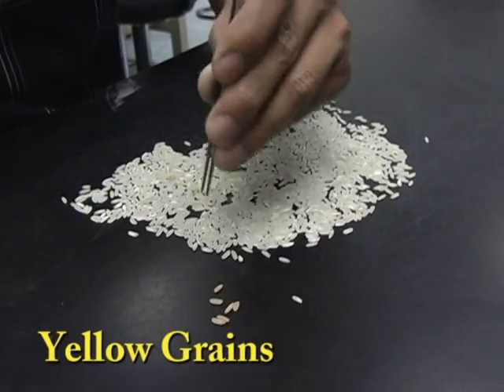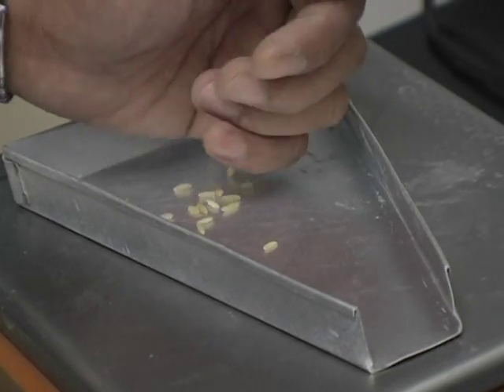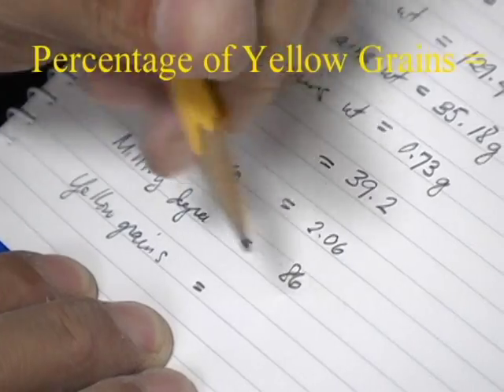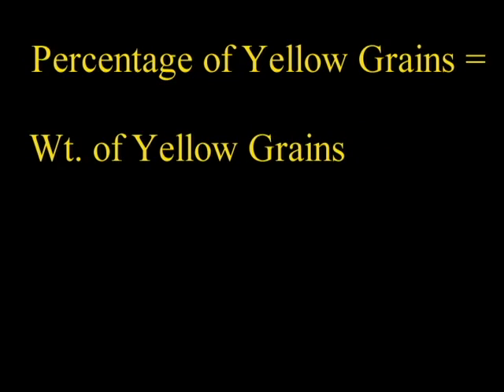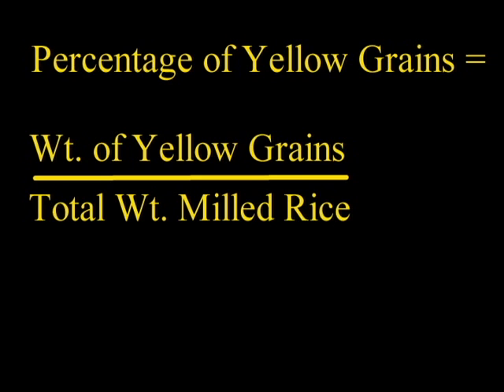Separate and weigh the yellow fermented grains. Then calculate the percentage of yellow fermented grains using the formula. Weight of the yellow grains divided by the total weight of the milled rice multiplied by 100.